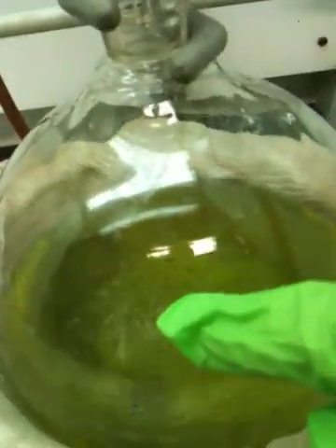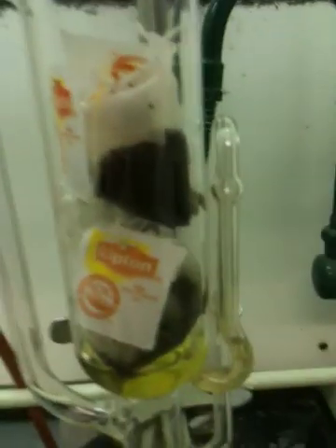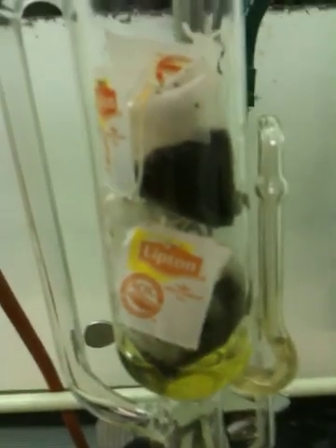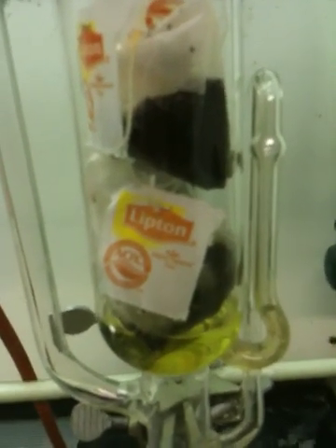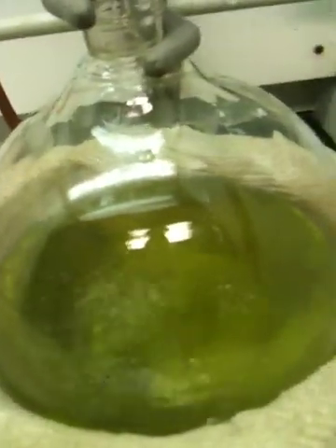The vapor is recycled. The dichloromethane is recycled by going through this sidearm, hitting the condenser, and coming back into this chamber, where it extracts more organic molecules out of the tea. In this way, one can very efficiently — exhaustively — remove caffeine from tea, obviously getting a lot of chlorophyll as well, by continuously recycling the same dichloromethane into the chamber and concentrating the caffeine and other organic molecules in the pot.